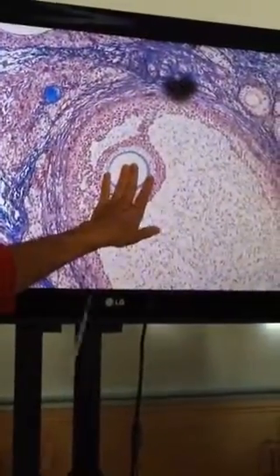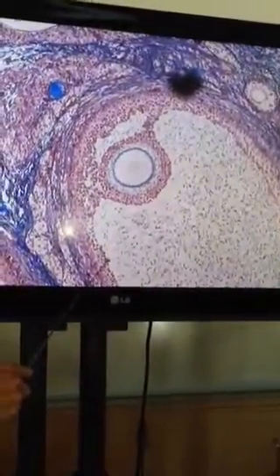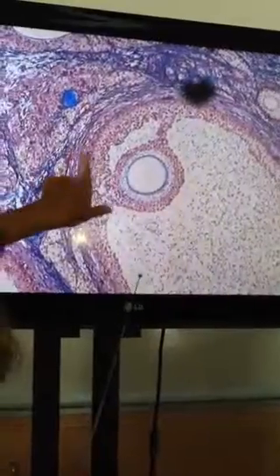We're not really concerned with that right now. We're doing the endocrine system. So what you want to look at are these cells out here. The whole round structure with the big cavity, the egg, and these cells on the outside is called a follicle, just like in the thyroid gland, where you had round follicles. So this whole thing is a mature follicle. It's called a Graafian or tertiary follicle, same thing. And these are the two types of cells you want to look at.